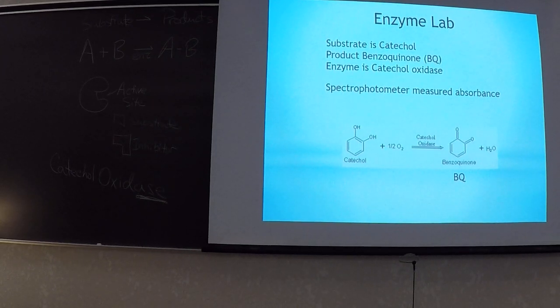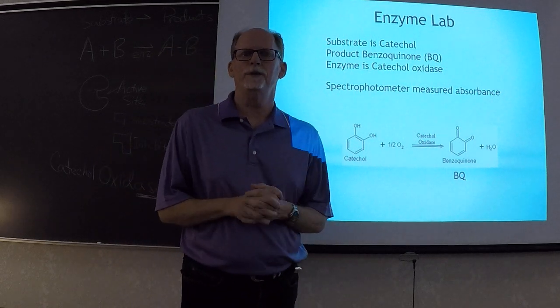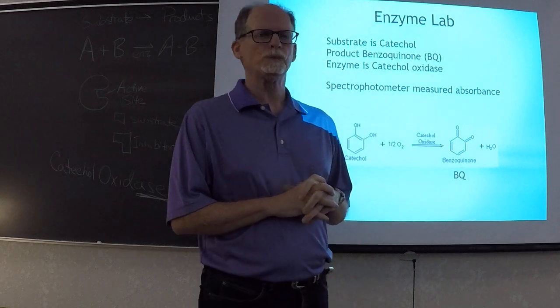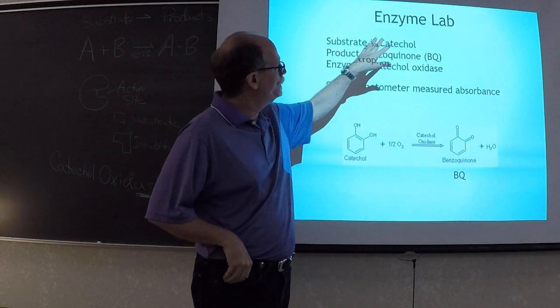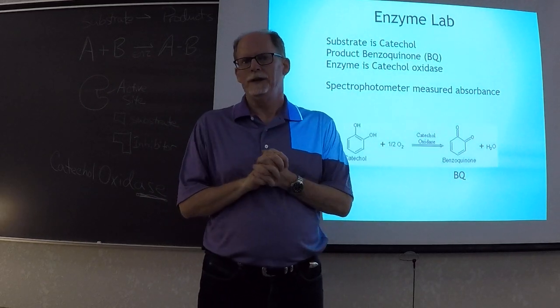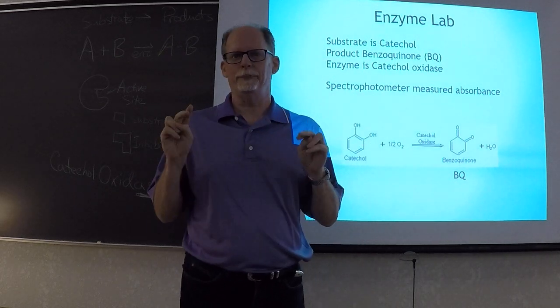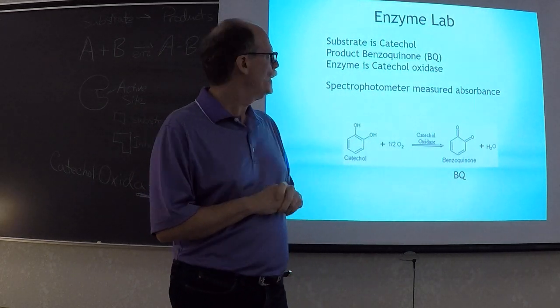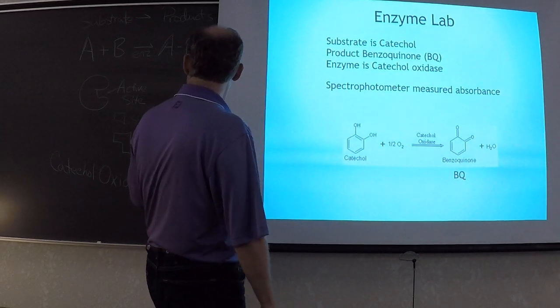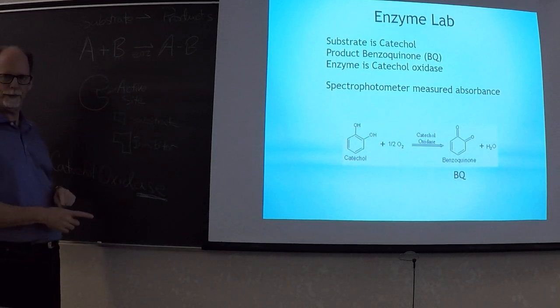So, this is a video for the Biology 1 Enzyme Lab. And in the Enzyme Lab, what we normally do is take a potato, blend the potato up, make say a potato smoothie, because we want to get what's called catechol oxidase. Right? Catechol oxidase is an enzyme.